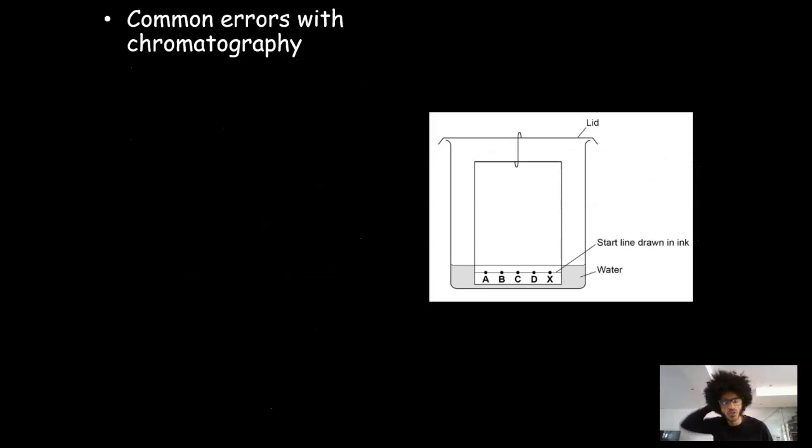The second thing is common errors of chromatography. So sometimes what they'll ask you, because the method's so straightforward, they'll have to find ways of testing your understanding. And one of the ways they test your understanding is showing you a flawed method or a bad method and saying, what is wrong with this? And it'll either be in writing or in a diagram. Now, as you can see here, I've got a diagram of someone who is a very confused student and doesn't really know how to set the whole thing up. And from here, you can see there are a number of errors that the student has done.